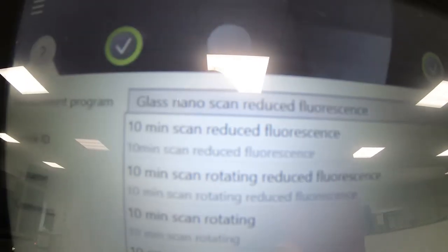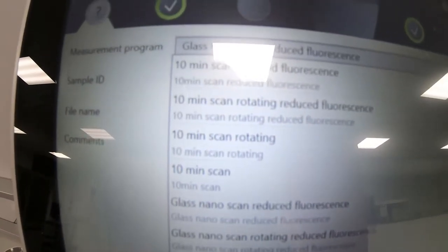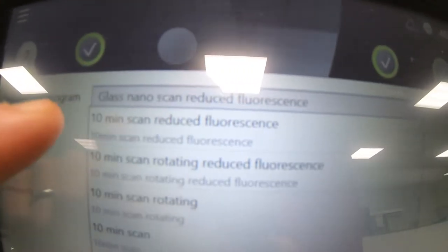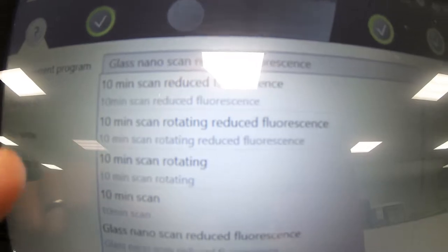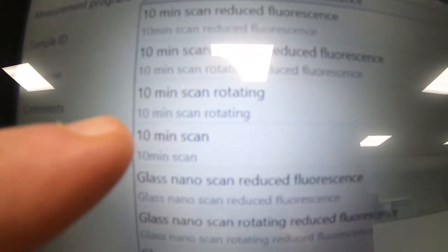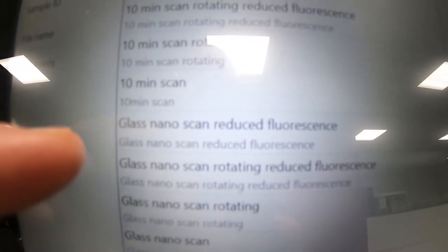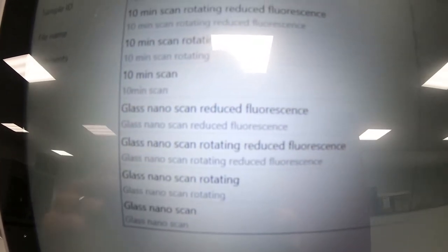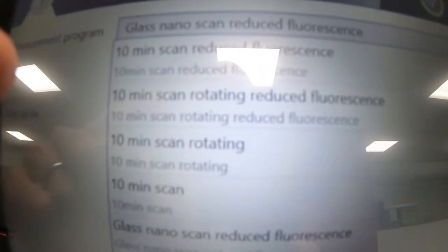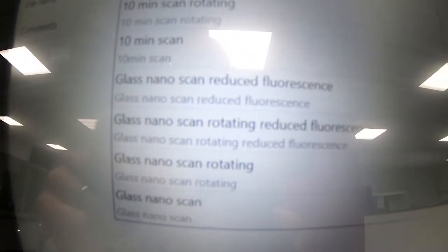Let's talk quickly about the measurement program. If I push this down here, you can see there are eight different scans that you can do, and they vary only slightly. We have a 10 minute scan with reduced fluorescence, a 10 minute scan that's rotating with reduced fluorescence, a 10 minute scan that's rotating, and a standard 10 minute scan. Then we have similar options but for glassy or nano materials. These samples are exactly the same as these except they have a larger step size. The step size in these ones is 0.02, and the step size in these glass nano ones is 0.04. That is the only difference between them.